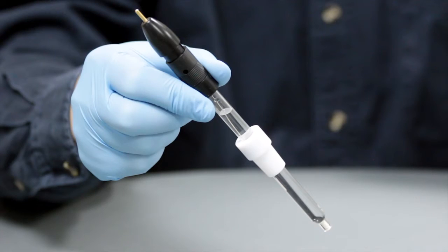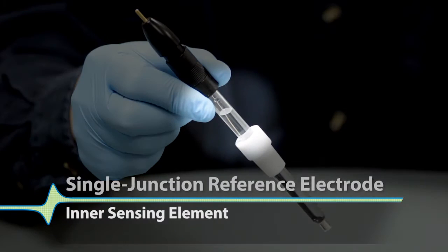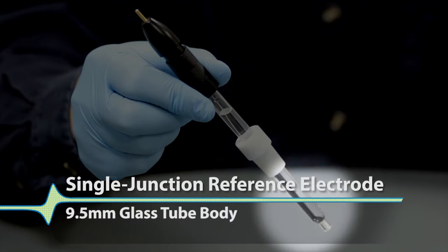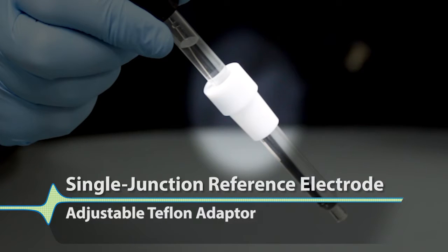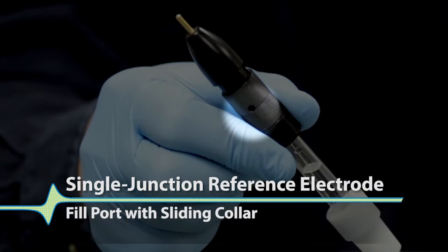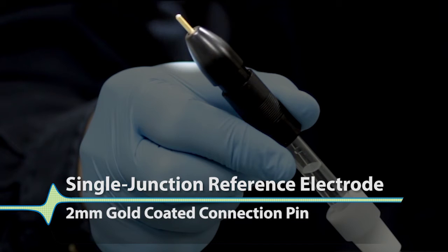The structure of the reference electrode is broken up into six parts: the inner sensing element, a 9.5 millimeter glass tube body, a tip with a porous frit, an adjustable Teflon adapter, a fill port with a sliding collar, and finally a 2 millimeter diameter gold-coated connection pin.